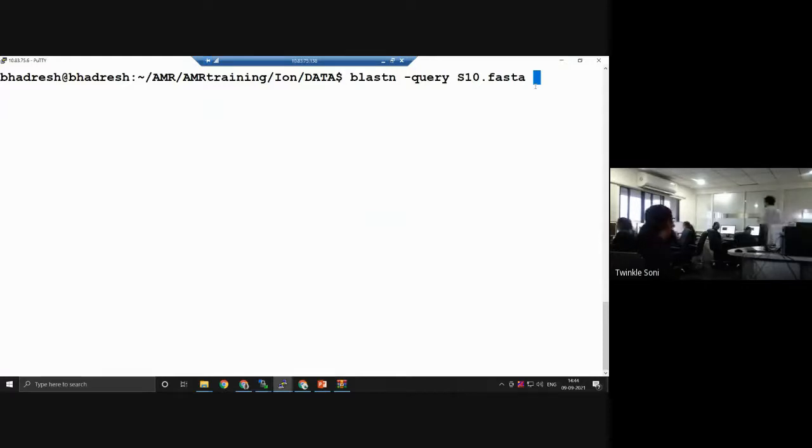आप फाइल का फर्स्ट 2 वर्ड लिख के टैब करोगे तो ऑटोमेटिकली वो आ जाएगा. Has everyone reached? Everyone had typed their query sequences? Okay. So next thing that we will be adding is database. So DB. DB is the command for database.